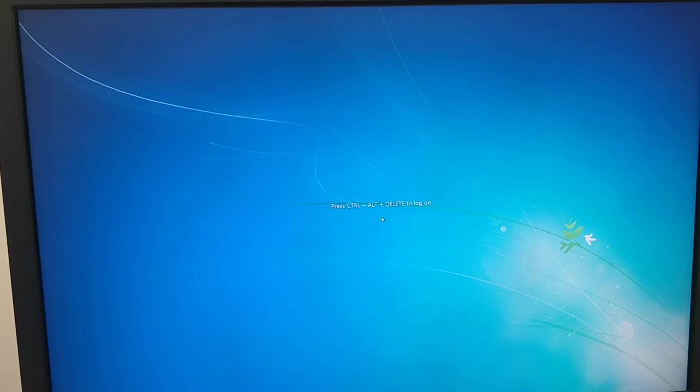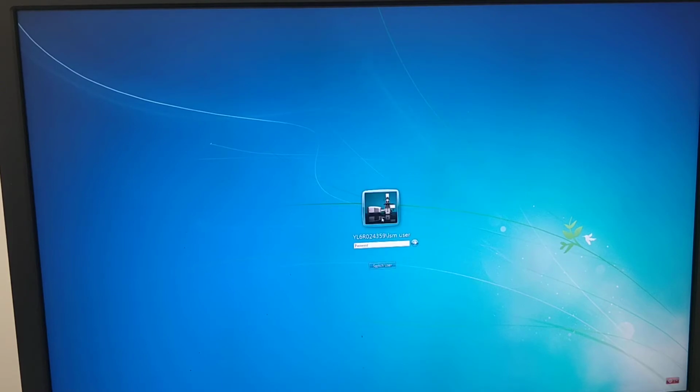So now we're going to go through the software part. Usually the LSM 780 computer is pretty much always on. If it's not on, then after you turn it on, you have this interface. You just have to do Control-Alt-Delete. Then it's LSM user as username, and there's no password, so you just need to click enter or click on this, and then it's going to go in.